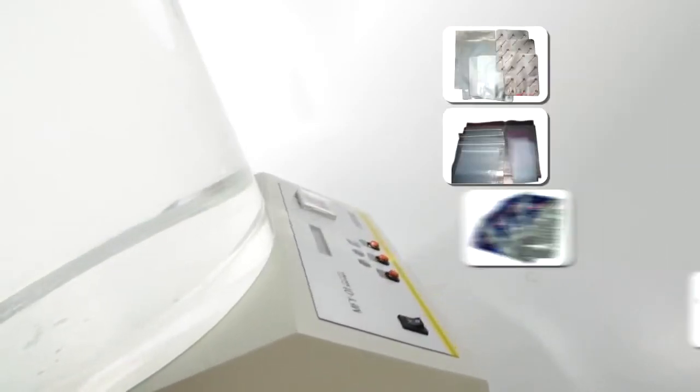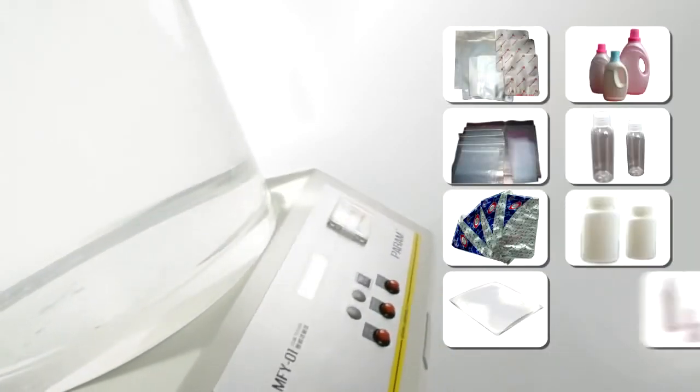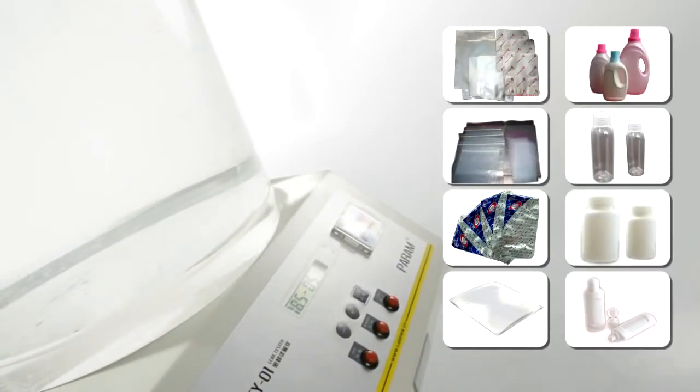The instrument can be used for leakage testing of pouches, bottles, cans and other sealed packages used in different industries.